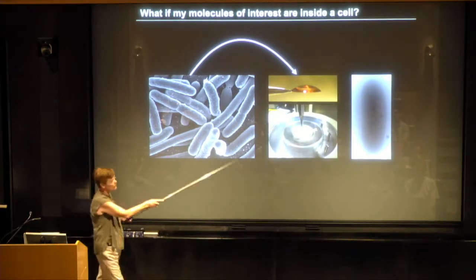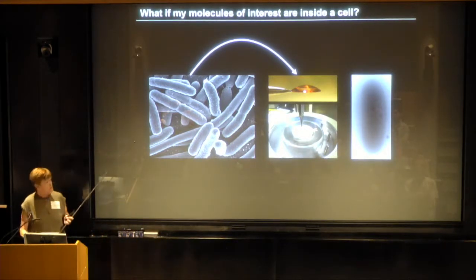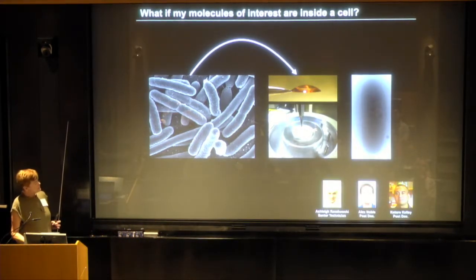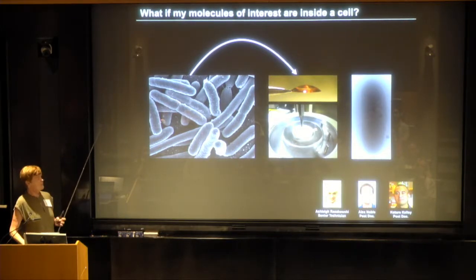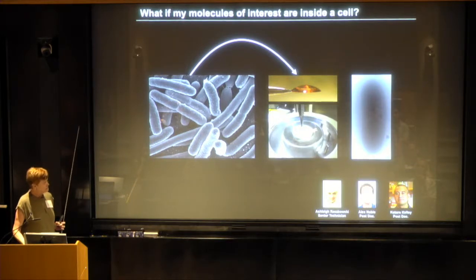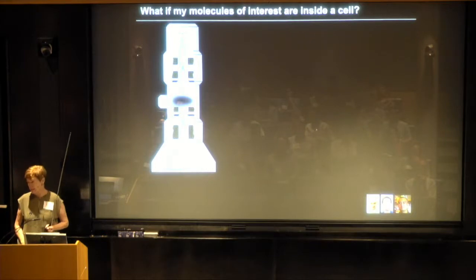We can just quickly plunge freeze it, and here's a little E. coli frozen. What we do then is we take that, and this is just the team of people at the Simons Electron Microscopy that are working very, very hard to get these methods established at the moment. We take that frozen cell now, put it back in the electron microscope.